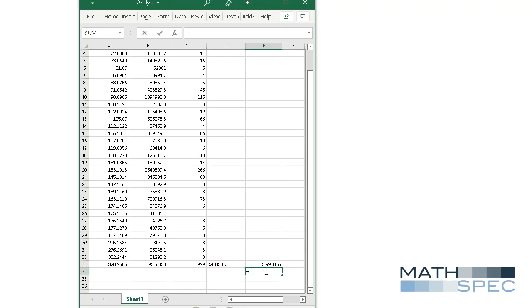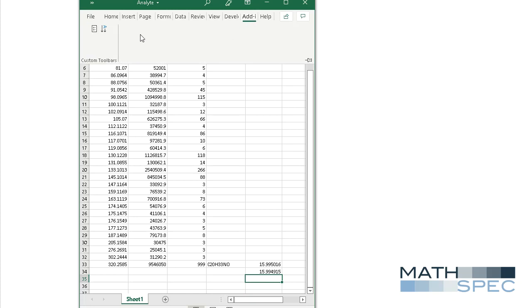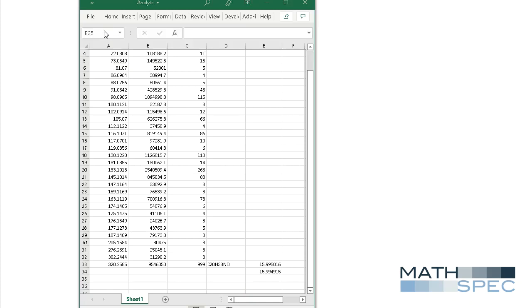If we look at the mass of oxygen, it's almost identical. So indeed, this metabolite of this fungicide is increased in mass relative to the fenpropimorph by the mass of an oxygen atom. So I'm going to click on the add-ins, and the little icon on the right side. If I click on that, that will bring up the worksheets that I need to produce modular structures.